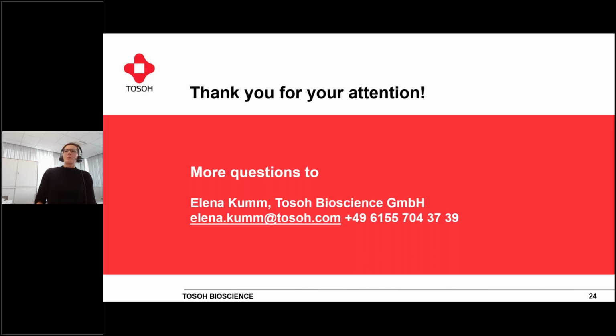I don't know why the person might have asked, but I would guess maybe because you, for example, have a tag on your protein and you would like to purify or analyze it. The only thing we have is tresyl columns. This means that you could bind whatever ligand you would like to have on the surface of your column, and then you can purify or analyze your sample with this ligand you bound on there.